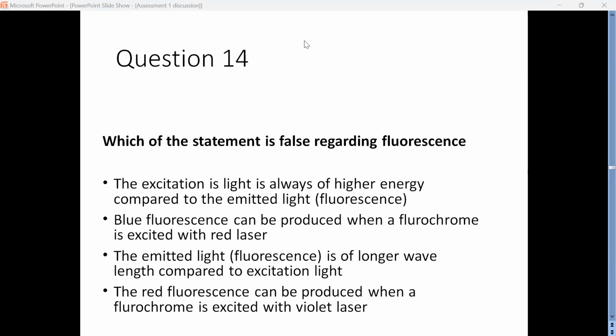Especially when you're doing some quantitative assays, those are high resolution assays. So you're asking to enumerate the low resolution ones. Any qualitative assay you do is a low resolution assay: immunophenotyping, leukemia, lymphoma. Though you acquire the sample in high pressure mode, the data is not going to be affected so much. But when you're doing ploidy analysis and stem cell enumeration, which are very important assays, you need to acquire the sample in low pressure mode so that you have very high resolution of the data.